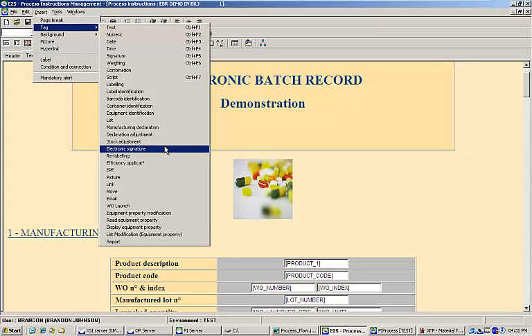Tags can also generate a transaction to send data to an ERP or control system, prompt an operator for an electronic signature, as well as a variety of other advanced functions.